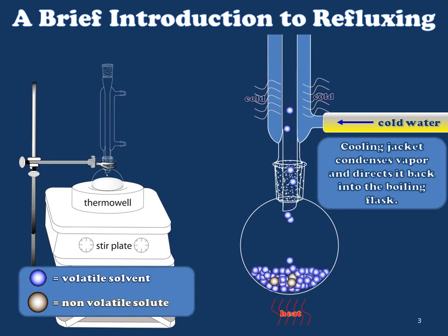Using this technique, we can boil organic solutions for extremely long periods of time, for hours and sometimes even days, without significant loss of volume. And this is the benefit of the refluxing technique.